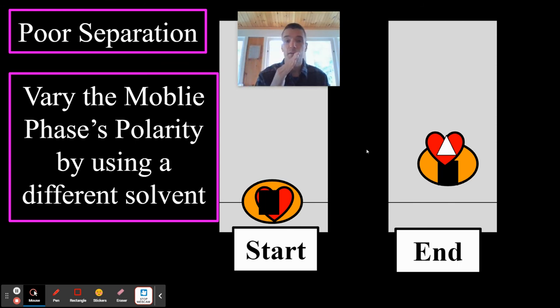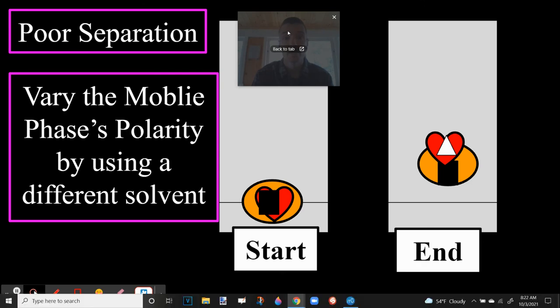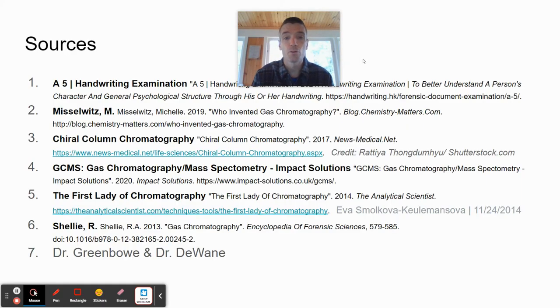You may make it more polar, you may make it less polar, but basically you just have to try things out until you can separate these molecules such that you're pleased with your results. Remember, chromatography works because it's manipulating the intermolecular forces of molecules and their natural affinity to different things by making them stick or not stick, or be carried or not be carried.